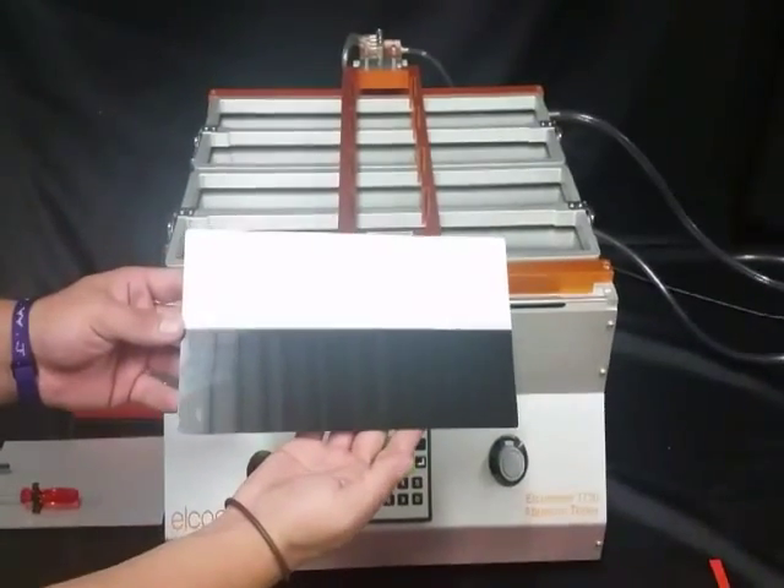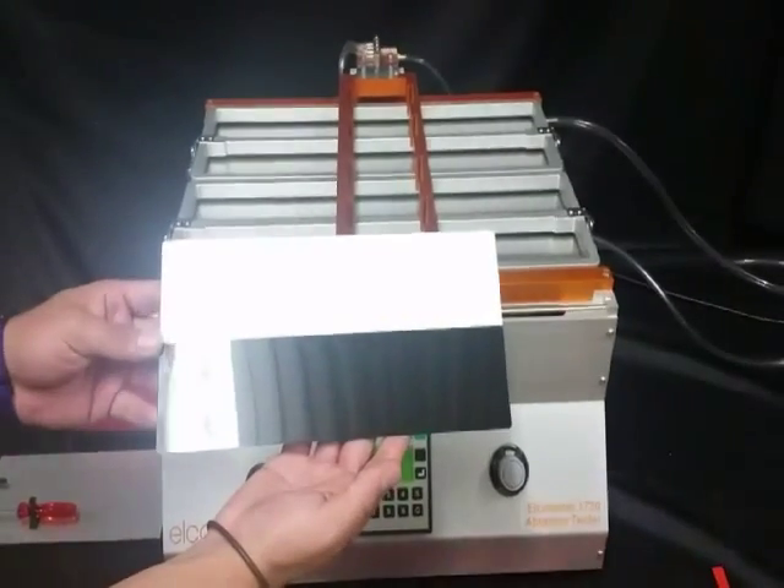We are going to be using the Leneta Metal Test Panel, number T12M.